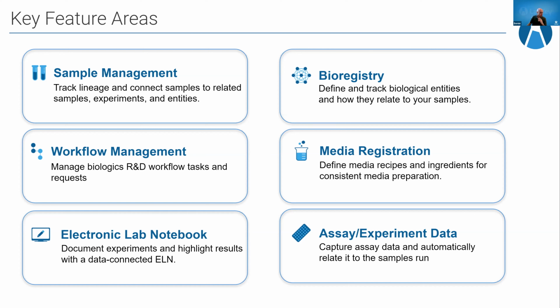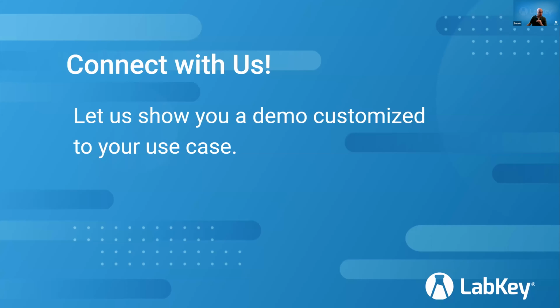And then I see an inquiry about some of the ways in which our Biologics LIMS is extensible. I think that's a perfect question for our next speaker. So let me jump forward a tiny bit and invite you to connect with us.